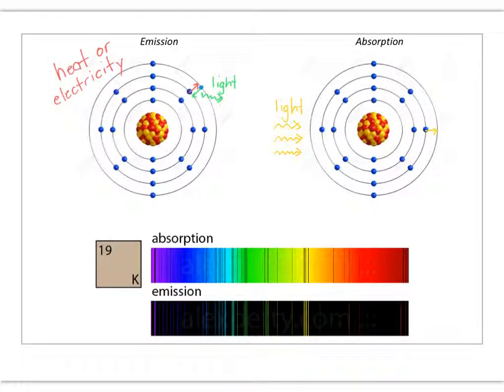So initially we're shining through this light. If some of this light has energy corresponding to this energy gap, it can cause the electron to jump up. That energy is then lost. It's given to the electron. And that light doesn't come through. We call these little packets of light photons of light. So 3 photons of light, and if some of those get absorbed, then we won't have as much light come through.